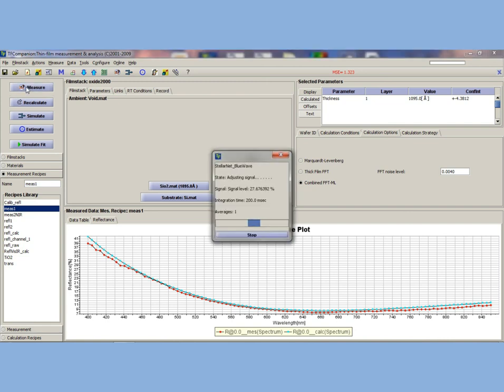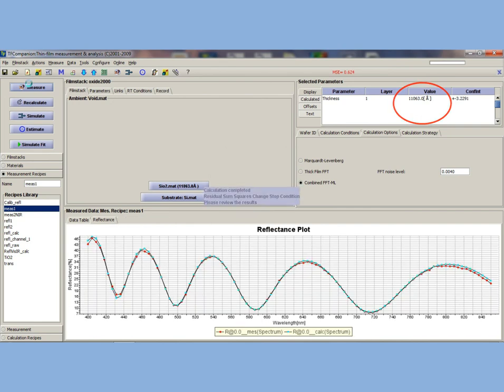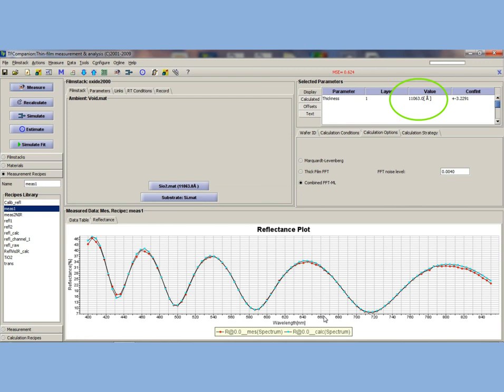You can see that the measured value is 1095 angstroms. Now let's measure the thicker standard. Place the thicker check sample underneath the probe and click measure. You can see the sinusoidal fringe pattern of the thicker sample and the data results in the upper right-hand corner.